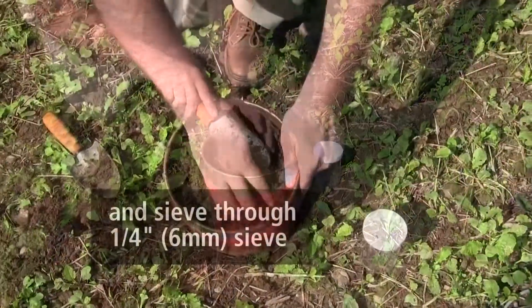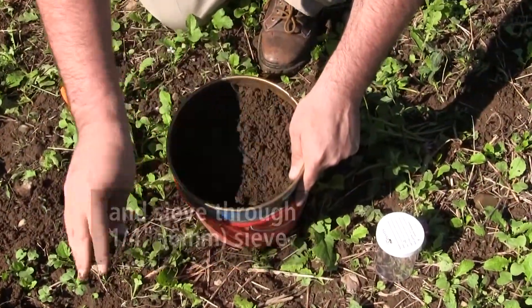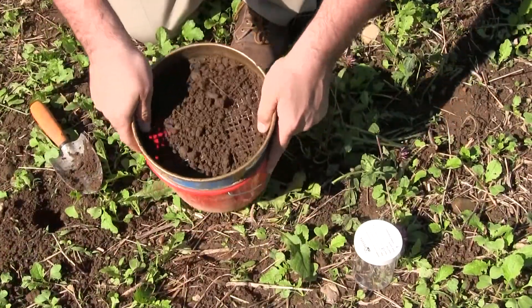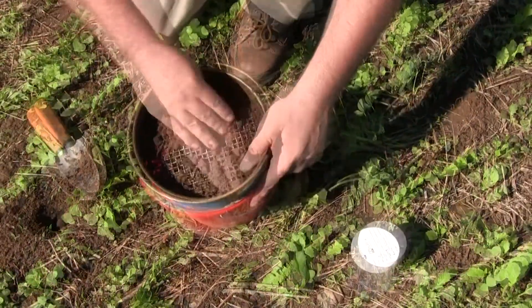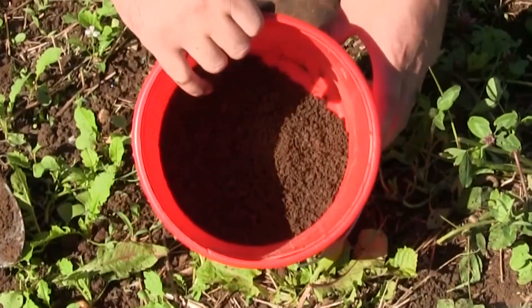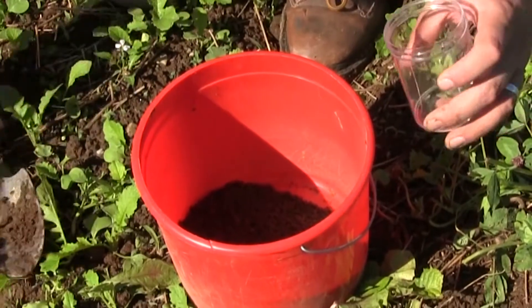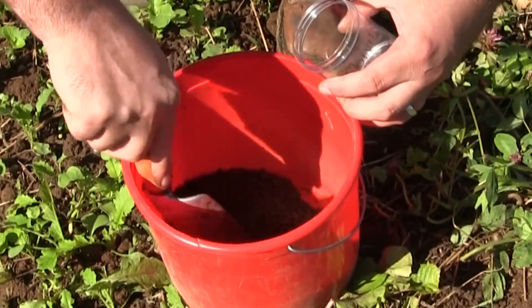So we want to sieve it down to a coarse sieve — it's about a quarter-inch sieve. We're trying to make sure that there are no rocks that get through, and then we want to take out any obvious roots or grass that may get in our sample as well.